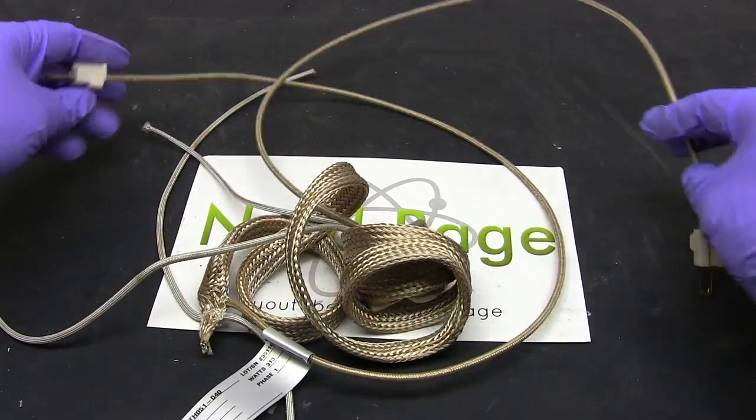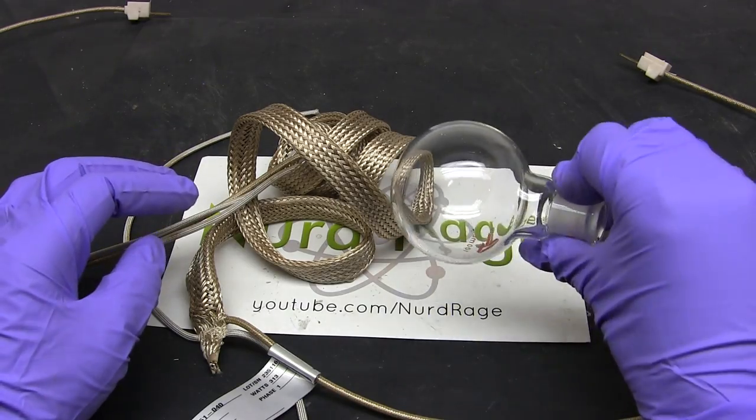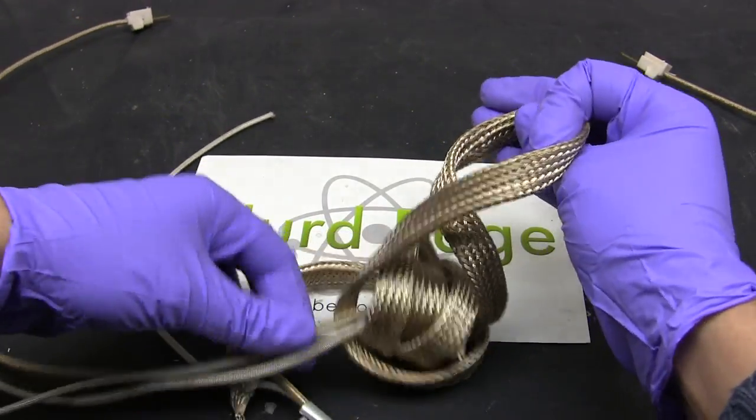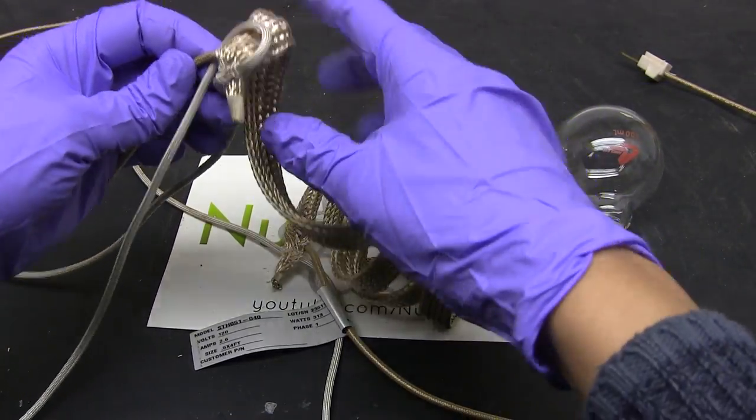Anyway, let's get started making the mantle. We're going to shape this to fit a 100 milliliter round bottom flask. You can use larger sizes if you like, the procedure is the same.